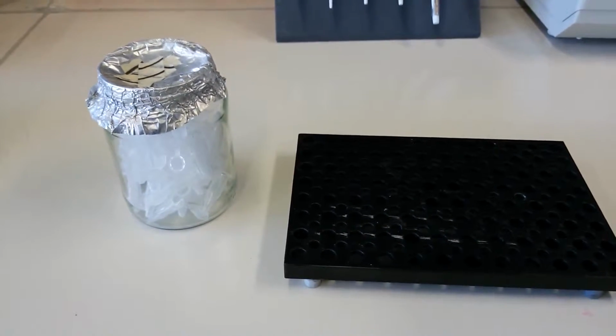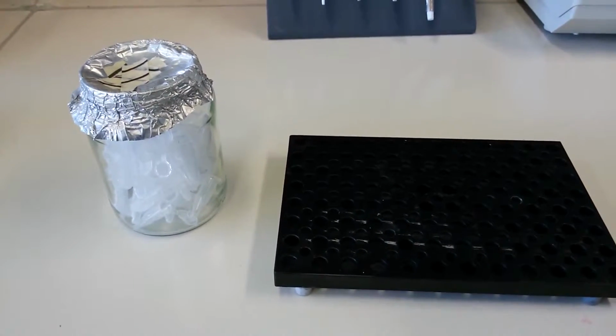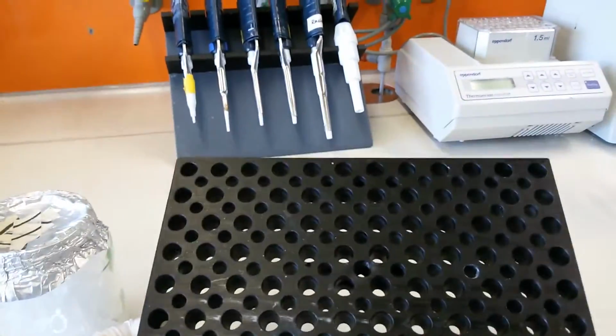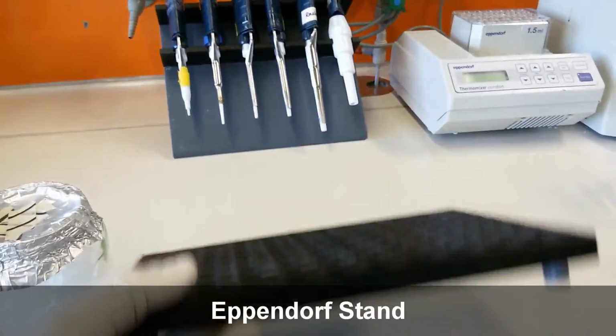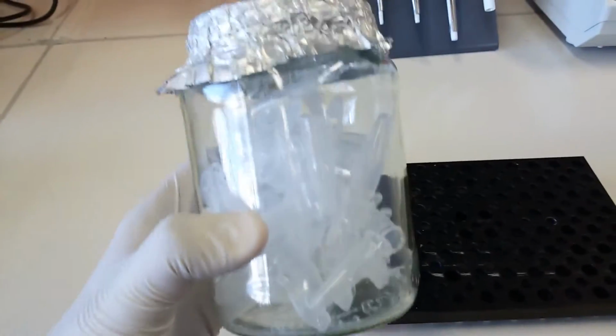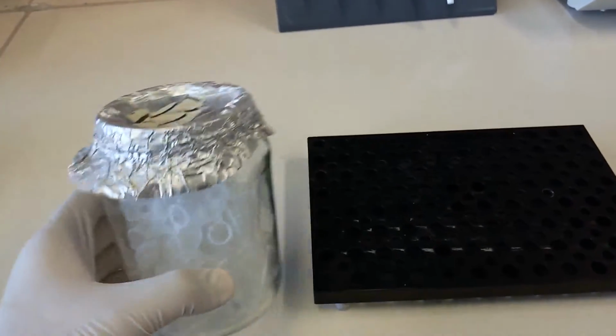Okay, so then this could be a very important lab utility. This thing is an Eppendorf stand. This is just like a normal stand. You put them here, and in these holes you can put the Eppendorfs, and we will see how. Now you can see these bottles, these are the Eppendorf tubes.